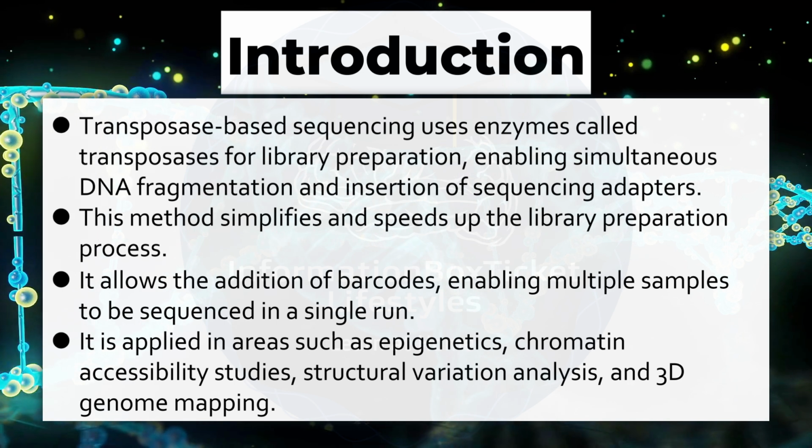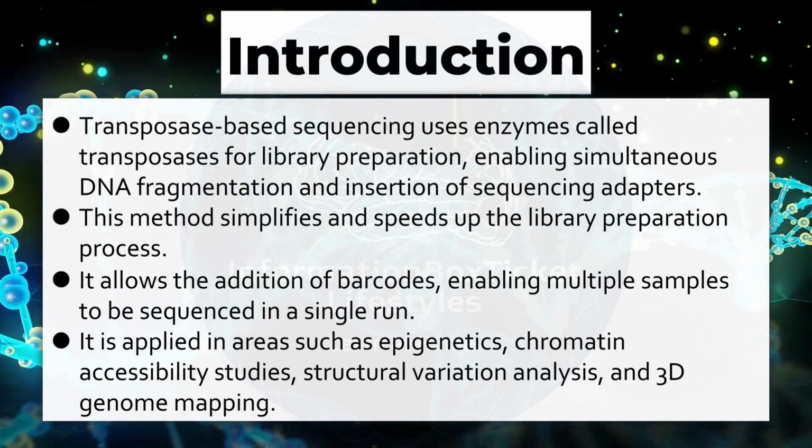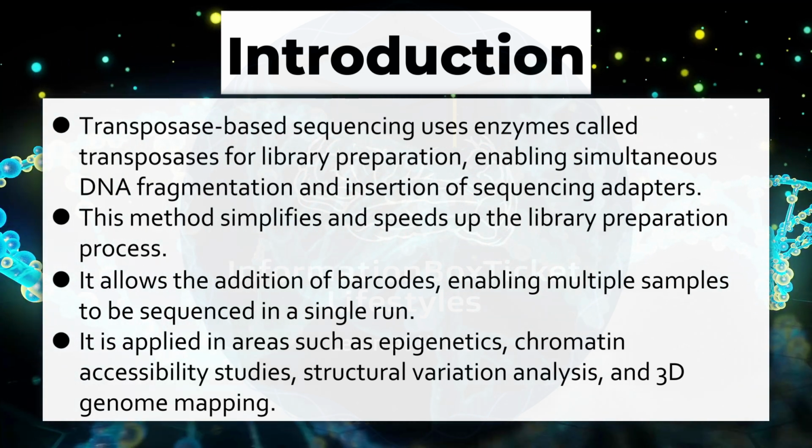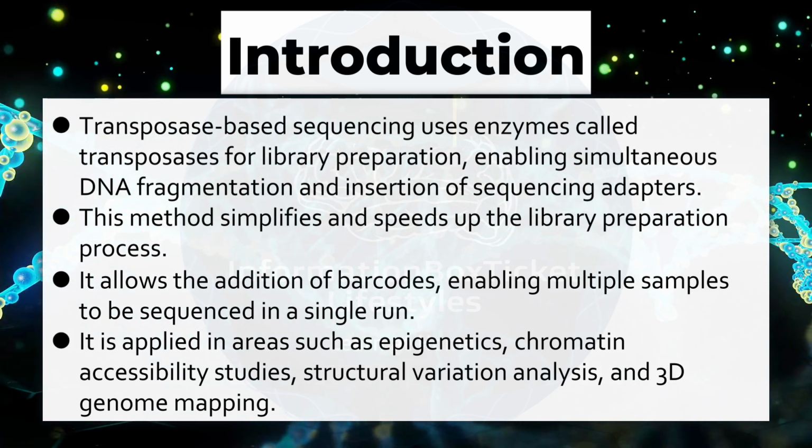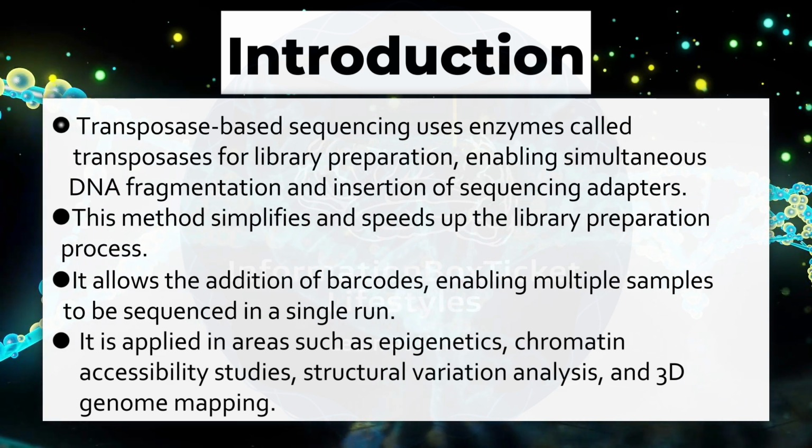It is applied in areas such as epigenetics, chromatin accessibility studies, structural variation analysis, and 3D genome mapping.